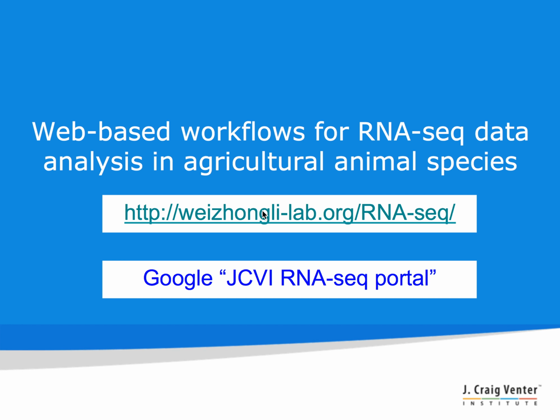Hi, in this demo, we are going to introduce the web portal developed at J. Craig Venter Institute for RNA-seq data analysis. This is to address the computational challenges in NGS data analysis, which remains a major bottleneck in many projects. So again, here is the URL of the portal. You can also Google JCVI RNA-seq portal to get access to the portal.